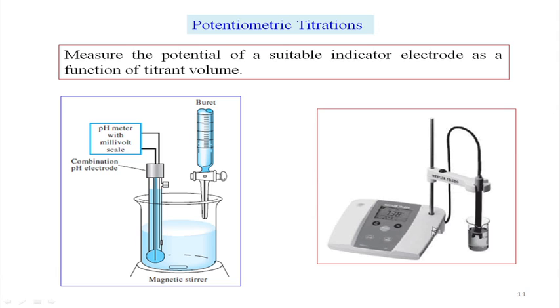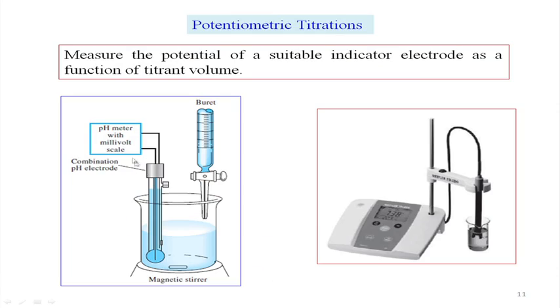So, directly you read the pH, but how do you do the titration? As we all know, the titration requires a conical flask. We add the burette and we have the indicator, the corresponding dye such as methyl red and methyl orange. Now, instead of that indicator, what you have in your hand is an indicating device, which we consider as your indicator electrode. So, without using that dye, we will now be using an electrode, because we want to do this by going for potentiometric titrations, which is the heart of the electrochemical methods of analysis.